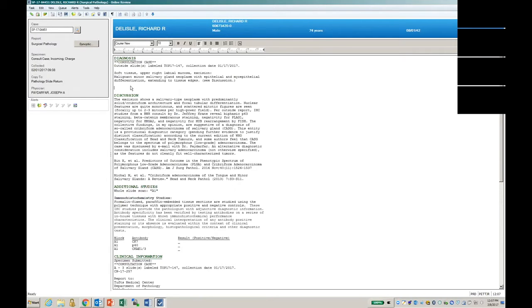Basically, we have tied specific templates to specific specimen types. At the time of accessioning, you may have a colon resection or whatever you have on your menu, the way you've named your specimen, and you can pre-assign available templates. Over time, we've added more and more to various specimens to make sure that we have them all available. But the way Cerner Millennium is set up behind the scenes, you have to assign them ahead of time.